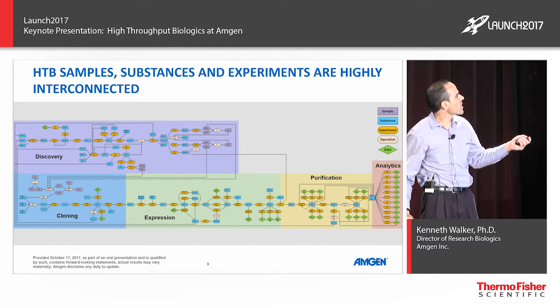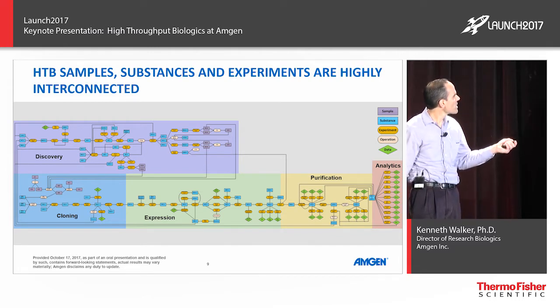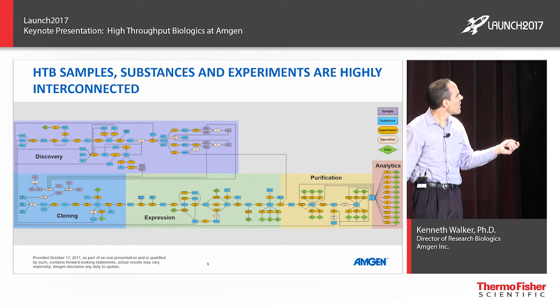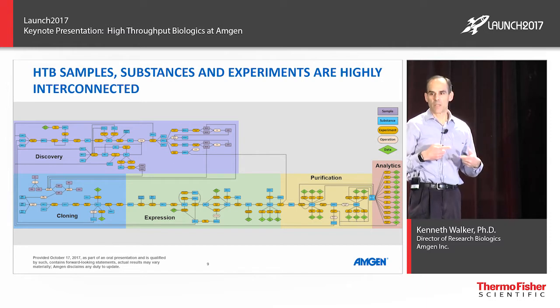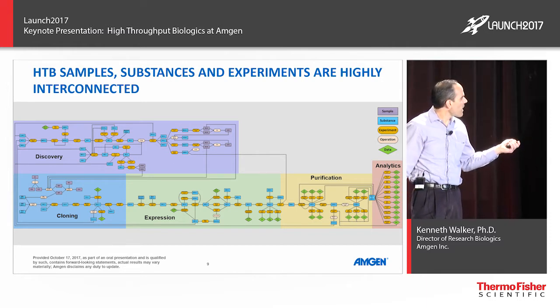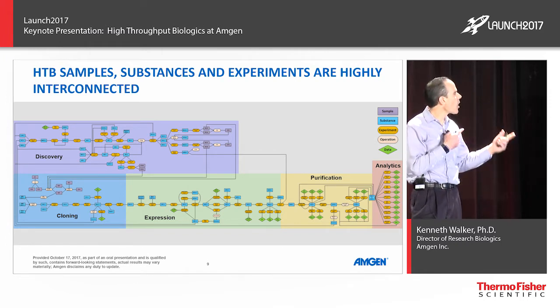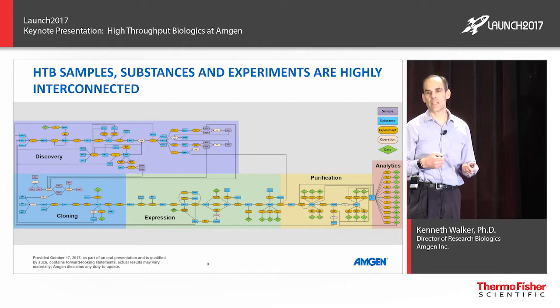So essentially, you're generating just information at the end. This information is then fed into this part here, which is really the engineering module. And again, that's why this is all samples. So this is just information here. You're basically engineering these initial hits to try and make them better. You then feed them back into this process, and again, you move your way through. And so that's how all of these things had to be really interconnected.